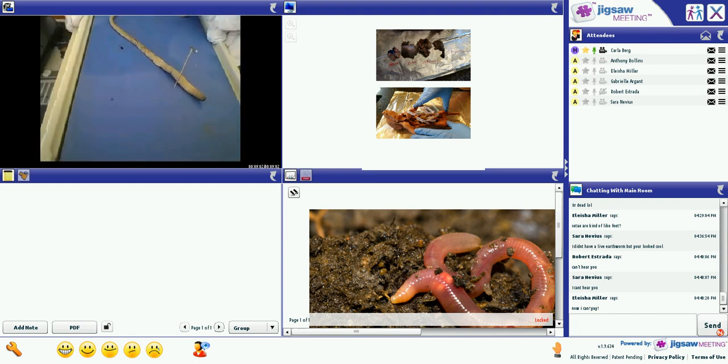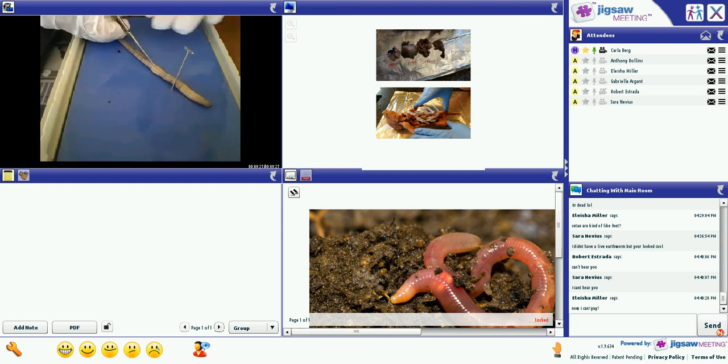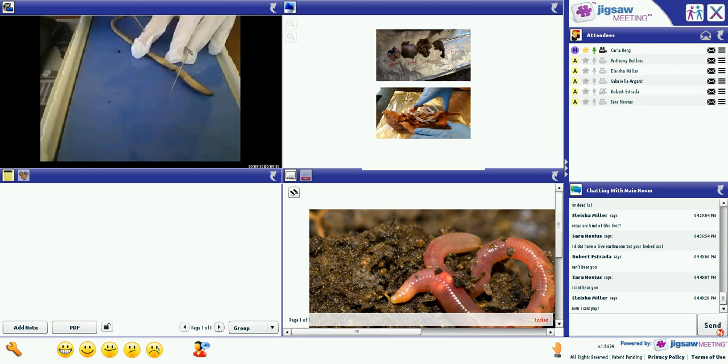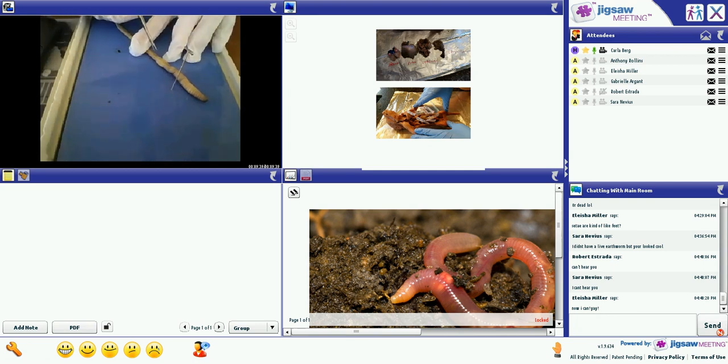Let me make sure you can see mine and I have a good cutting angle. So I am going to cut using just the tips of my scissors all the way up my worm, all the way to the mouth. Nice and gently, nice and slowly. This is not a race. Go ahead and make your incision. Do not cut your fingers. It is a little tougher to cut through that clitellum.